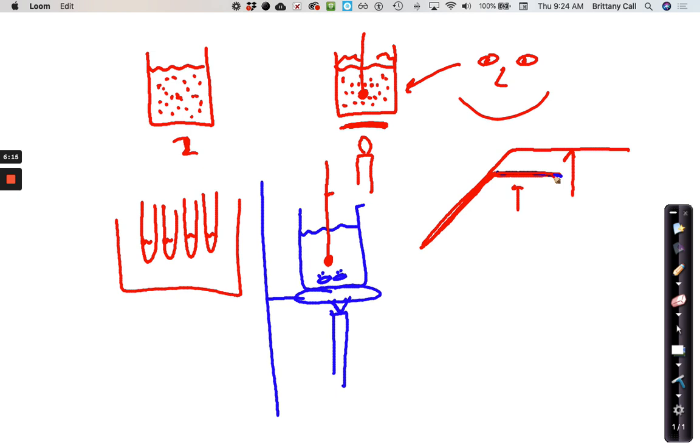Oh, sorry. We want to record that. Guys, that's trial 1, right? Down there, that's where you would record that temperature that you've got. Good? Yeah, after step 4, you'd record what temperature you have. Okay, then we're ready for step 5.